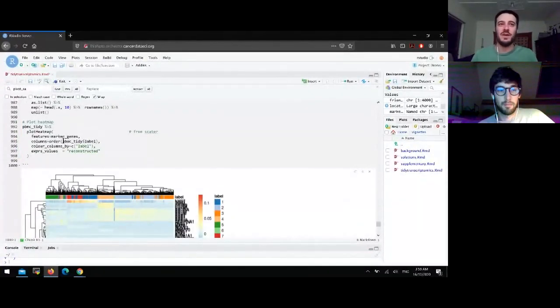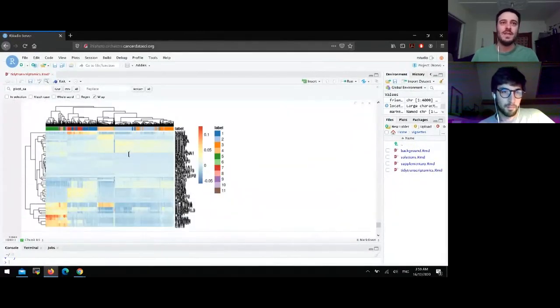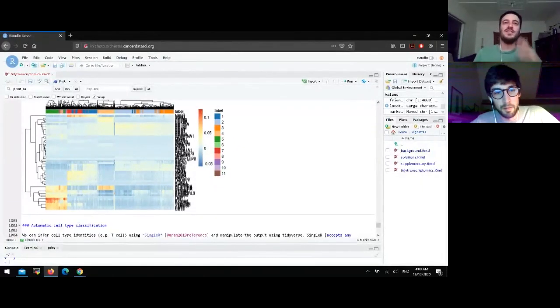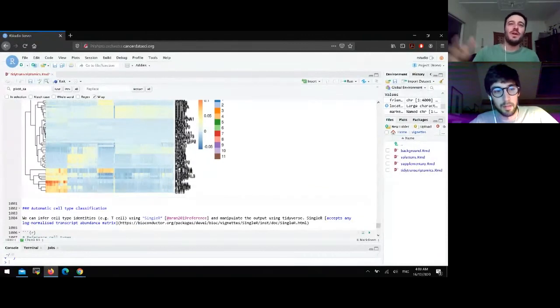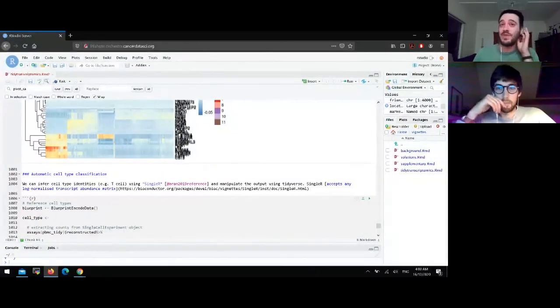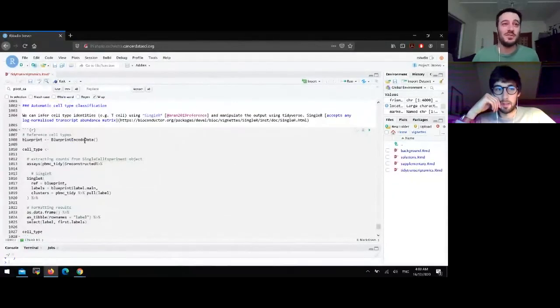We are just annotating by cluster. And we can see that cells generally cluster together according to the cluster annotation. We can go deep into which genes are preferentially transcribed in each cluster and do some evaluation. This is just an example. It's not that pleasing, but it shows that normal procedures from the Bioconductor repository are always possible.